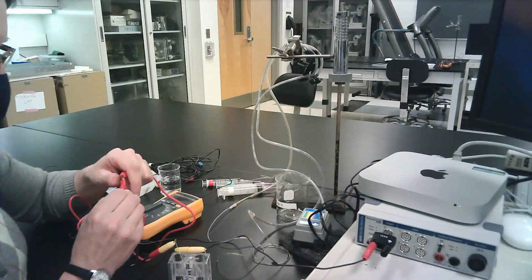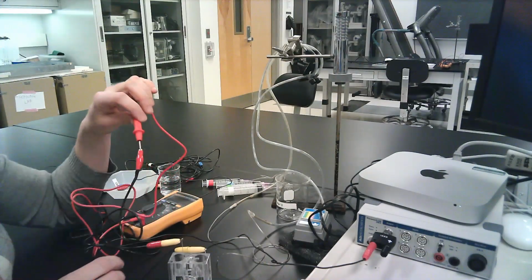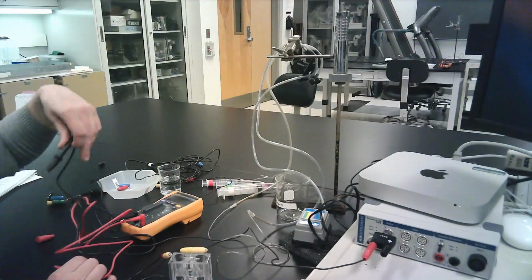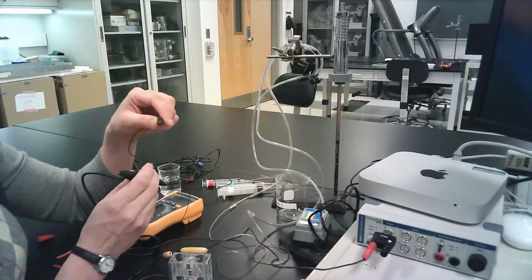If these alligator clips give you trouble, let me know. They're a little bit delicate in construction, so it might take a bit of work to get those connected correctly. Okay, then for the black end of my multimeter, I'm going to look for another alligator clip, double-ended alligator.